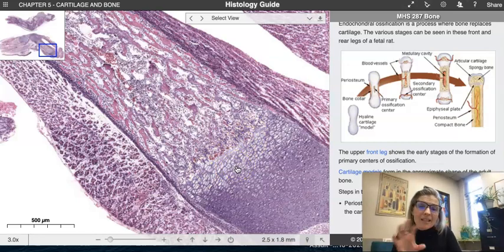We see two sides of the coin with a long bone, because we can see primary ossification, and then when we pull the epiphyseal growth plate side, this epiphysis is starting to also go into the bone formation process, which is the secondary location, which is why we call it secondary ossification. There's also a difference because this bone, although it's spongy right now, look at all those beautiful trabeculae, that will be remodeled into osteons, right?